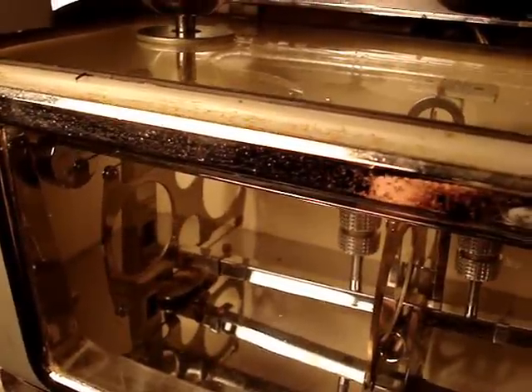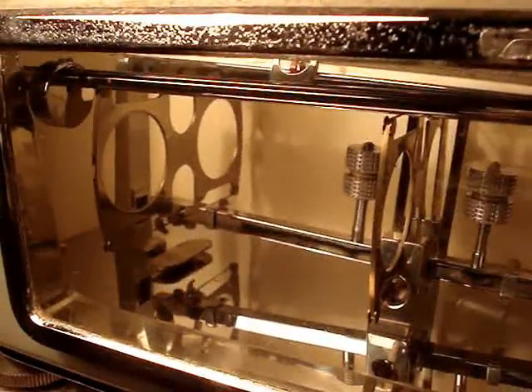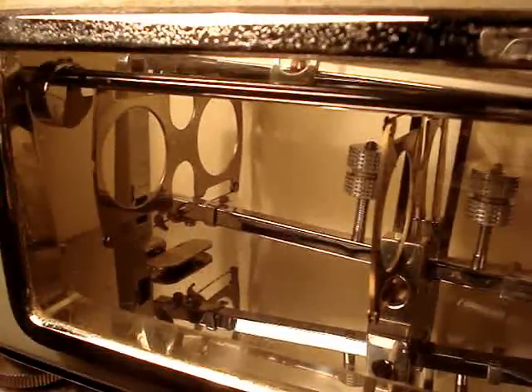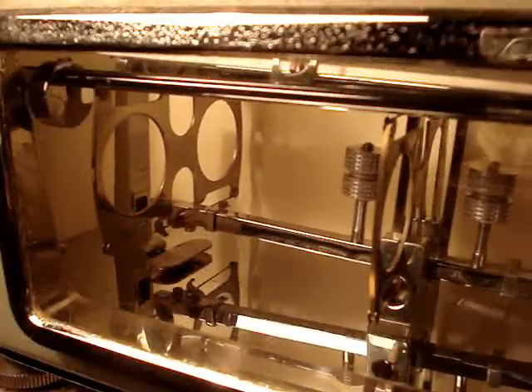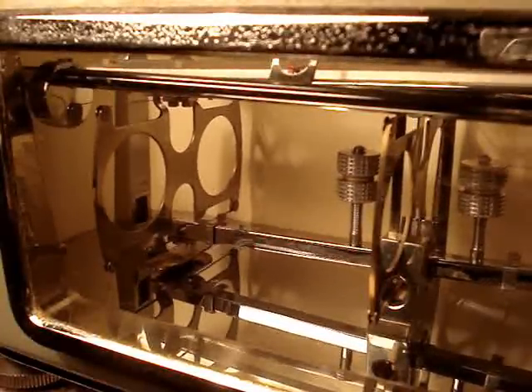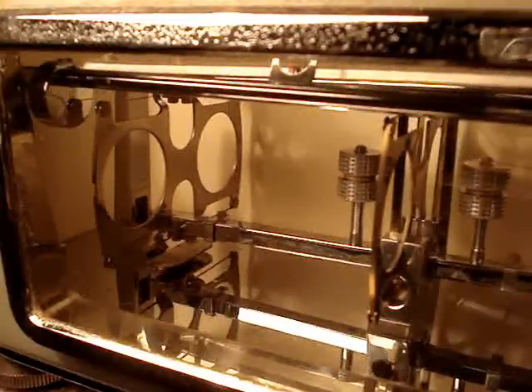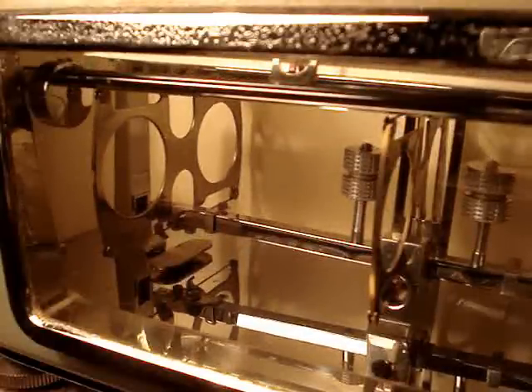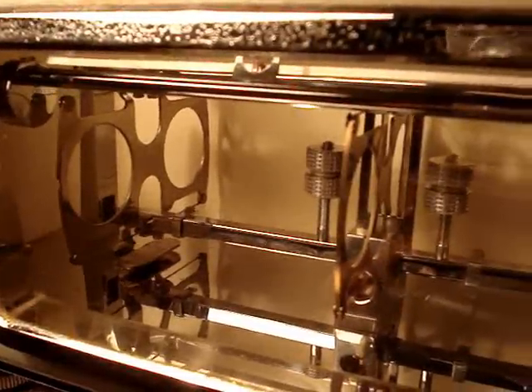I just tapped on it with the end of a ballpoint pen — see, the mechanism is very fine, very precise, very precision, and very desirable. I'm laying it lower for you so you can see the glamour — the full glamour on the left side of the scale. If you buy this, you'll have what I call full glamour, not partial glamour. This scale gives you the full quota of glamour. You can do rocket science, weigh nuclear atoms and nucleus radions — you could weigh a pea, but a pea might be too heavy.